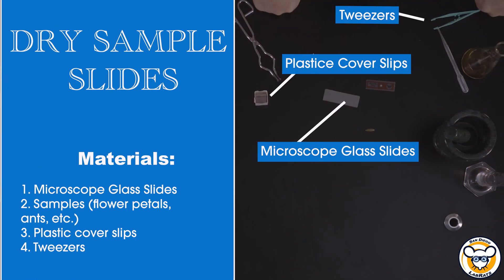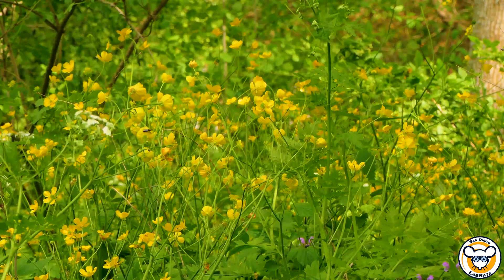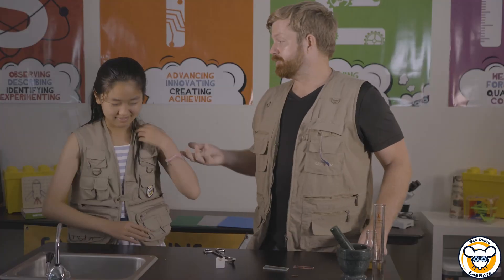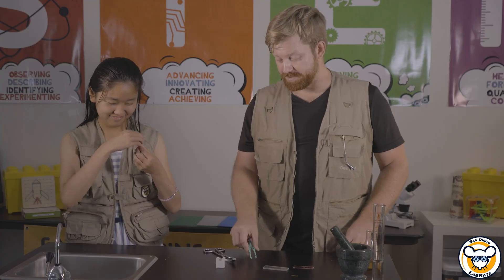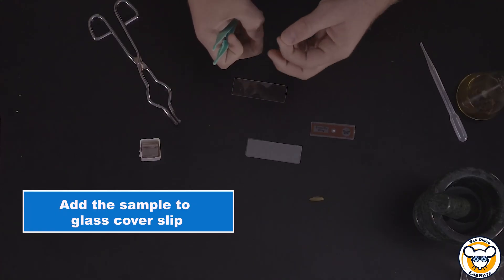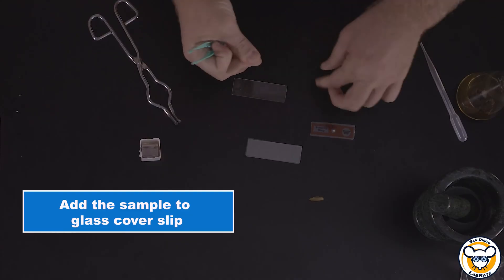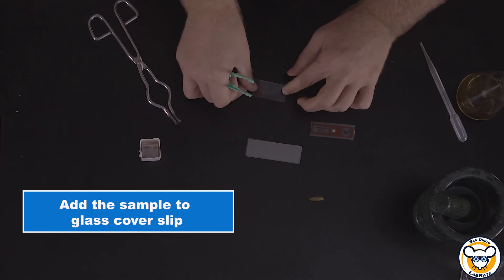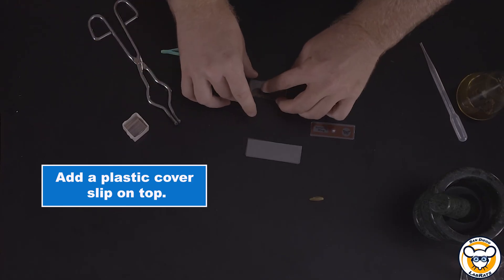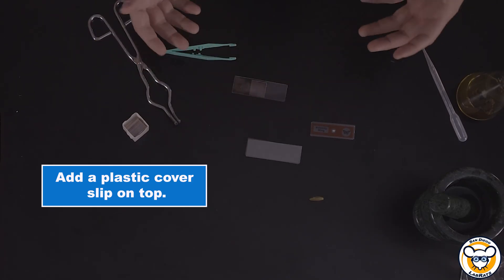First we're going to be looking at a simple dry mount. This is the act of taking any kind of sample, typically something that's dry in nature — some kind of plant that you found outside, maybe a bug. In this case, Adora was generous enough to donate one of her hairs. Take the sample you're working with; in this case we're going to do part of the hair because it's rather long. Taking a cover slip, dropping it down simply to help hold your sample in place.